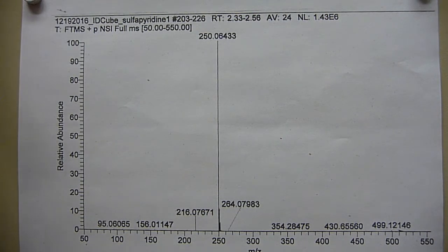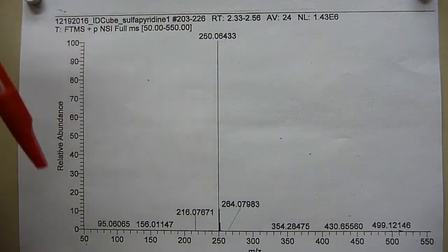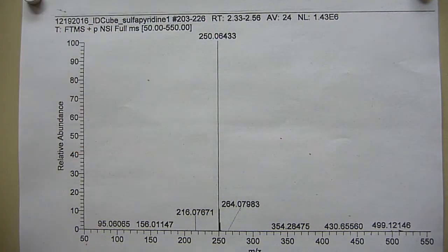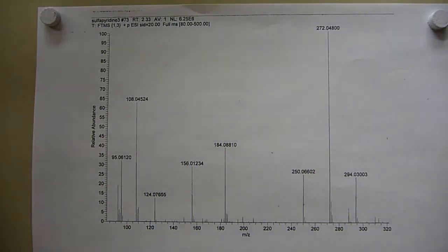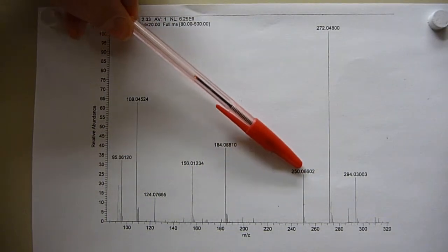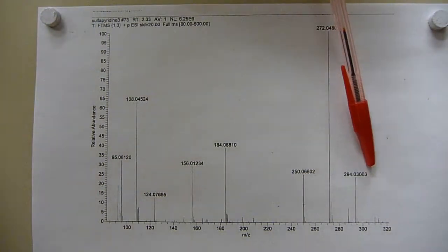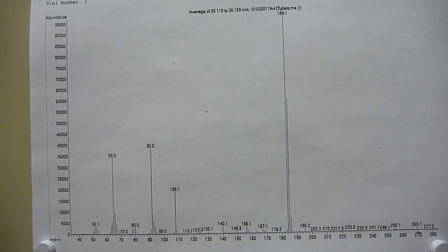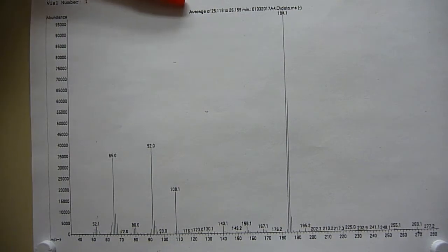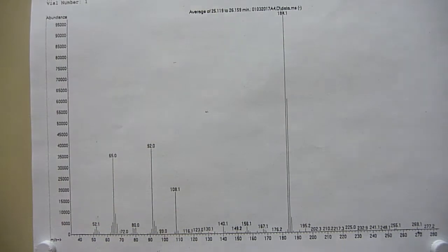Quick ten-second each spectrum recap. The DART spectrum shows a big M+1 with very little fragmentation. The positive electrospray shows M+1, M+23 sodium adduct, two sodiums, and a big 184. Electron impact, the most energetic, shows a big 184 and 185 with no indication of the molecular ion whatsoever.